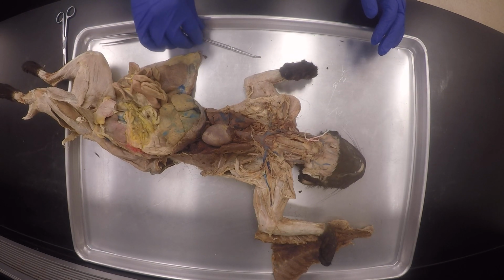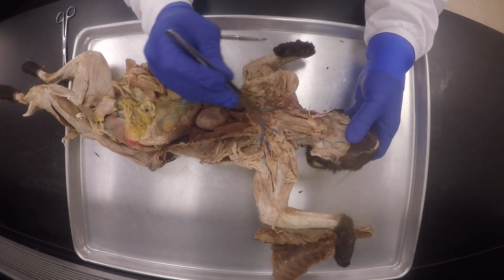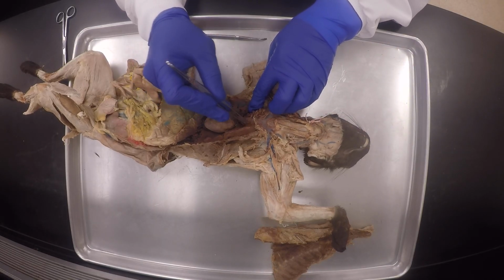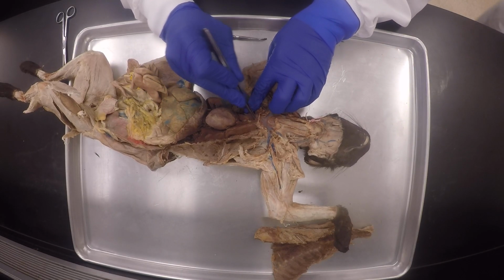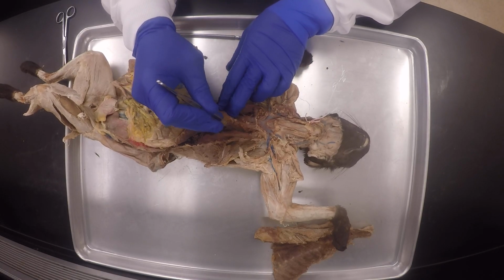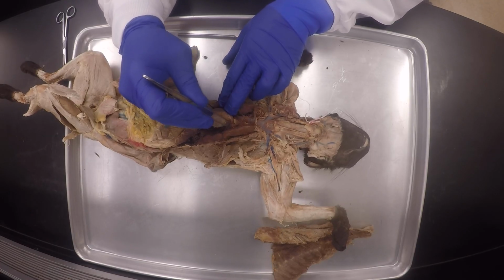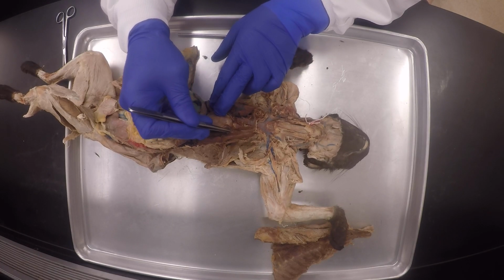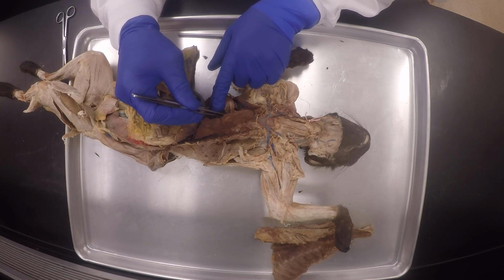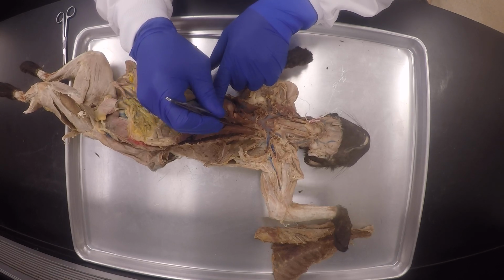So now we're just doing the cranial arteries. As you could see, the arteries are not very well infused. But you can see the aorta, the aortic arch here.